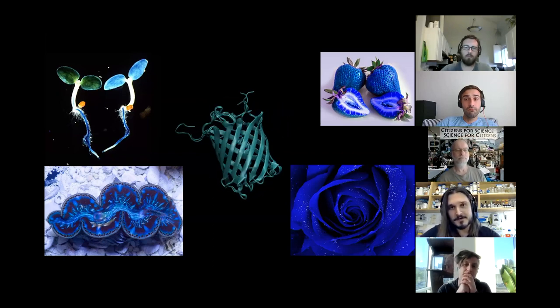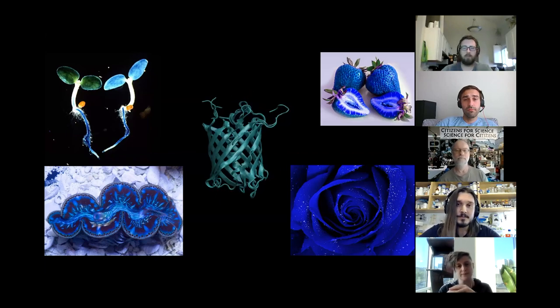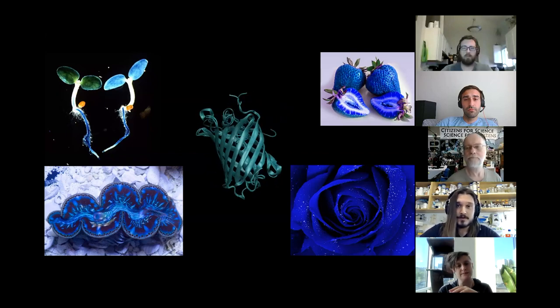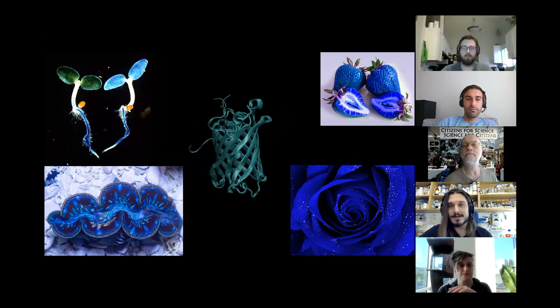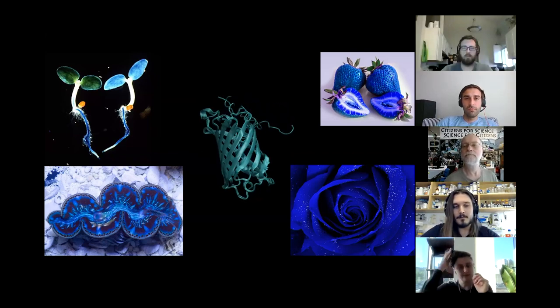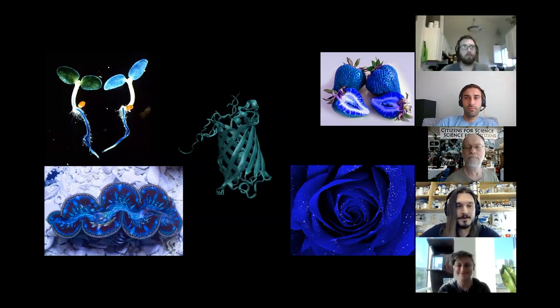Now, if it looks like green fluorescent protein and it acts like green fluorescent protein, then maybe I could express this in a plant, because green fluorescent protein has been expressed in plants as a marker for a very long time, right? It's tried and true. Using petal promoters, we can get it into the actual flower, so it looks just kind of like the rose in the bottom right. But my biggest interest is also the top right, which is strawberries, right?